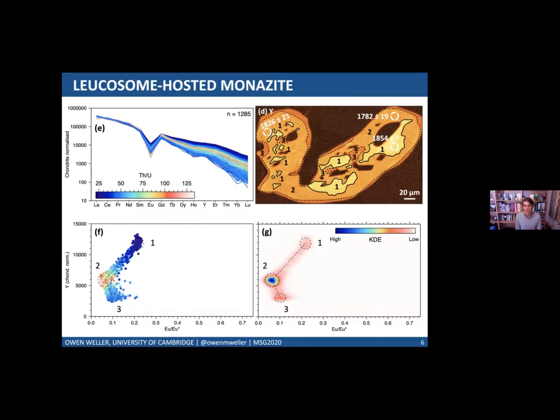By synthesizing all of this data, we were then able to overlay on top of that yttrium map a fairly confident interpretation of the growth zoning of that sample. And the 1, 2, 3 labels are meant to signify a relative aging based on core, mantle, rim relationships.